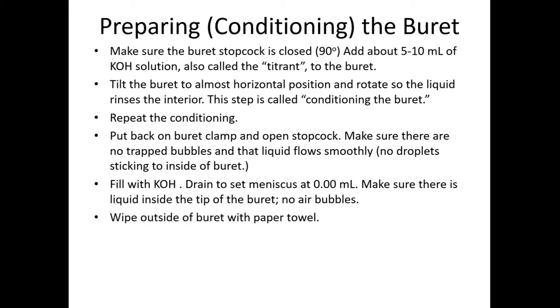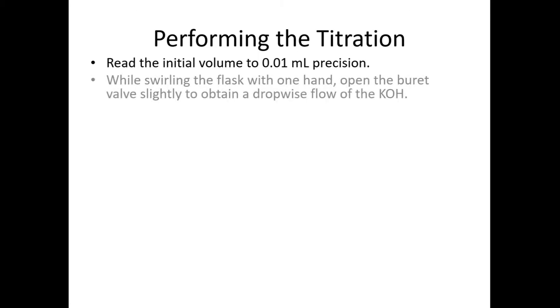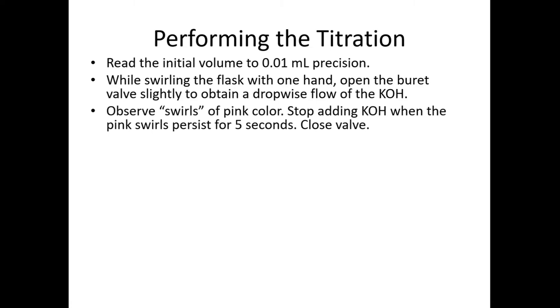We typically give the outside of the burette a little wipe down just to make sure we didn't accidentally spill some of the KOH on the outside, which would affect our readings. To perform the titration, we take the initial volume on the burette, and then while swirling the flask with one hand, we open the burette valve slightly to get a drop-wise flow of the KOH.